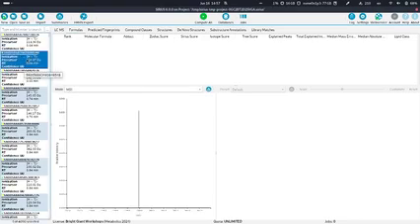And maybe just a tip, if you're using these numbers and want to find something, here the numbers all start with the same digits, so they are just an enumeration of the features pretty much. So if you want to find a specific compound, just use like the last 4 or 5 numbers, and you can just type it into the search bar. I will also very soon show you some examples where we do that.